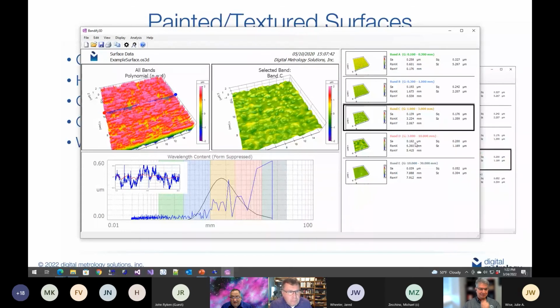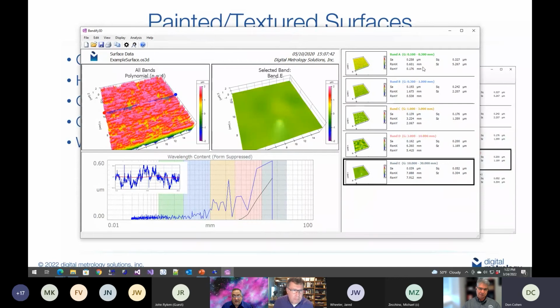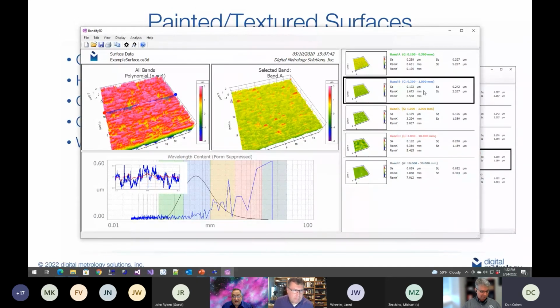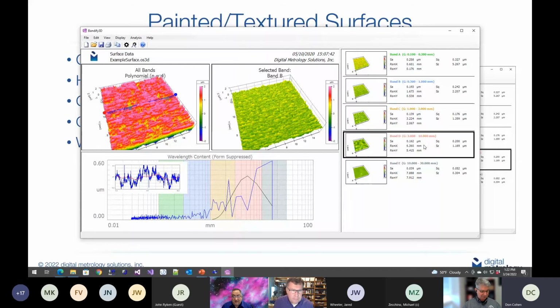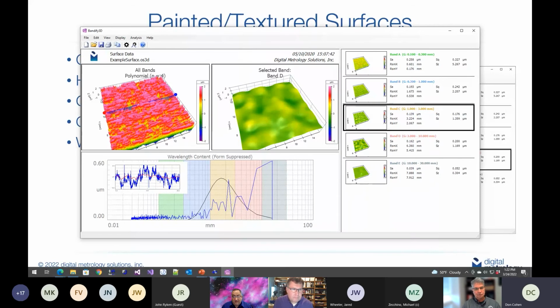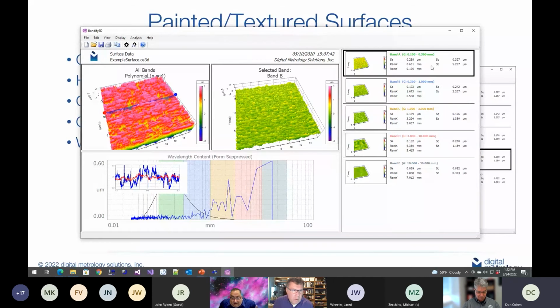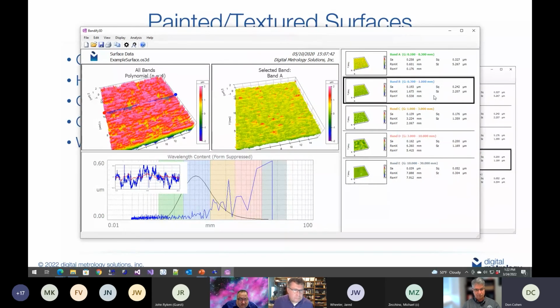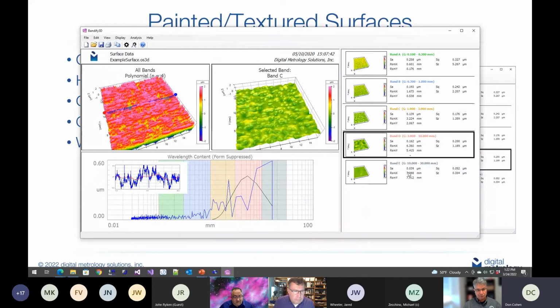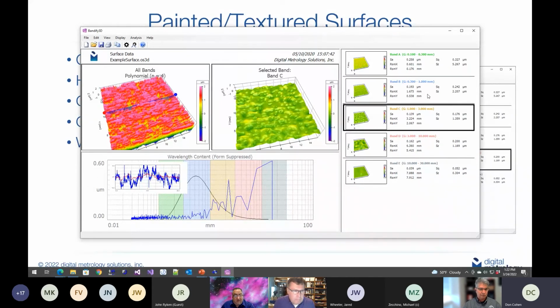Okay. Yeah, that's actually a good question. There's a lot of different instruments out there that say gloss meter and haze meter and all that kind of stuff, but I'm not aware, and that's just because I'm not that deep into it, of an actual spec that says it's these spatial wavelengths. I think what you'll see is people define their own bandwidth of spatial wavelengths of what they call haze and gloss and all that kind of stuff. And I'm sure we'll hear later about some other instruments and what the bandwidths are. But again, I'm not the great expert in that, and I'm not aware of some kind of ASTM standard that says haze are these spatial wavelengths.